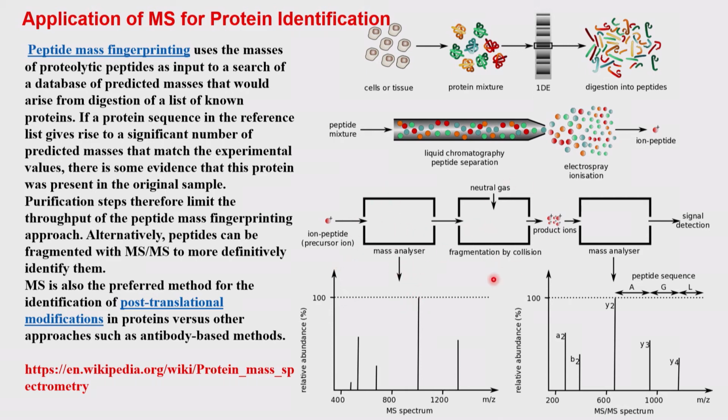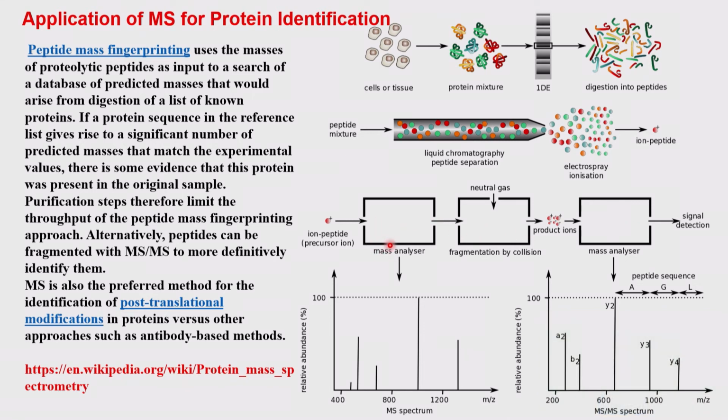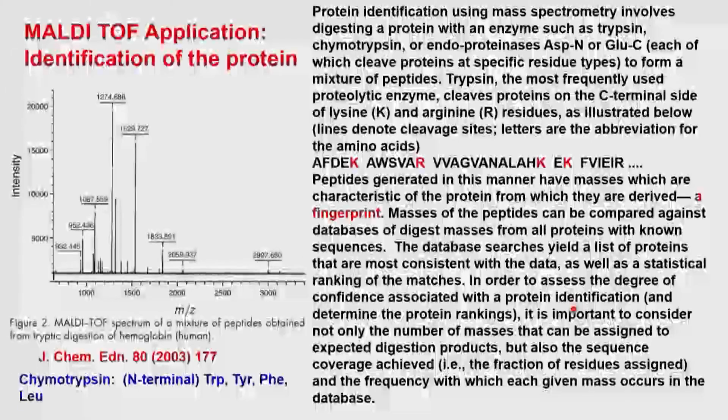You can further collide these specific ones, and then get further fragmentation, and then you can get more ions and you can measure. So, you can take one of the proteins, further ionize and get it. You can take a mixture and look at each protein. This box will tell you different kinds of proteins getting into that. There is very little fragmentation. Therefore, you can compare this with the data available and then say what kind of proteins are there in this mixture. Then a particular protein can be further broken by ionization, and then you can look into it. So, all of these are there.